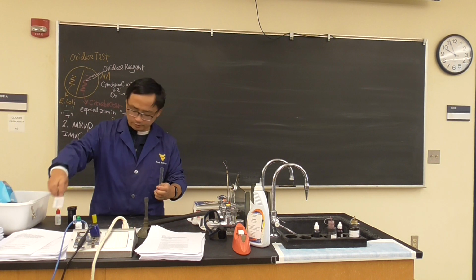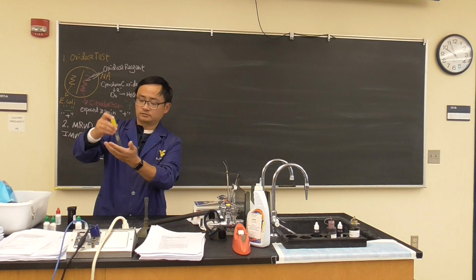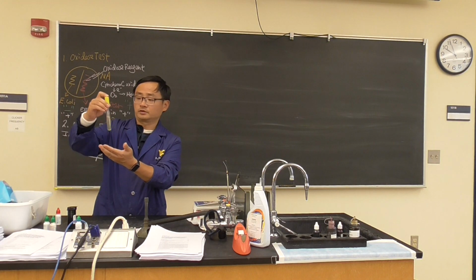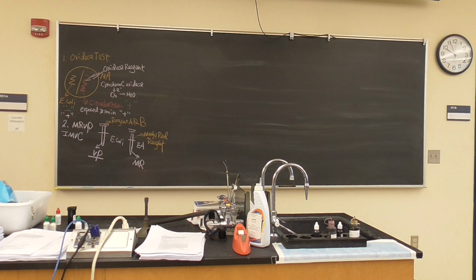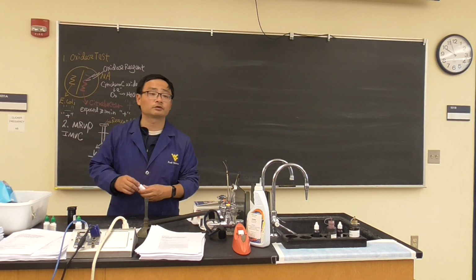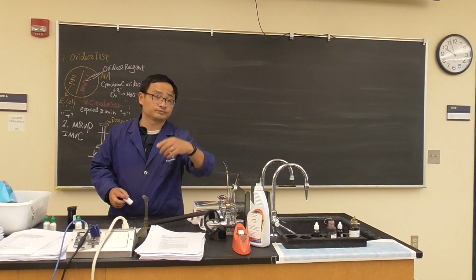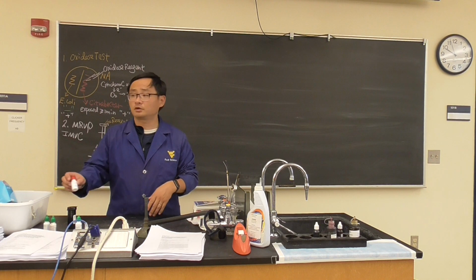The reaction could take more than 5 minutes, or even 30 minutes. So let's just leave it there and we'll see later if it turns positive, with a red color, or not. Okay, what does that one look like? That's fine for me. Still red, but we'll see.